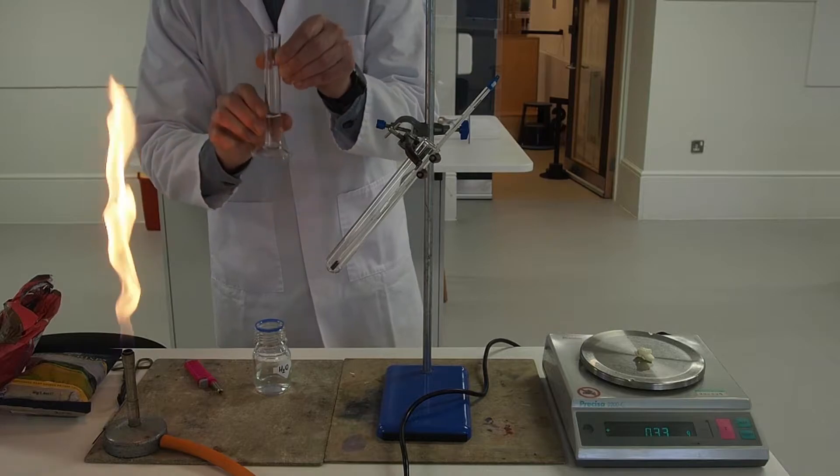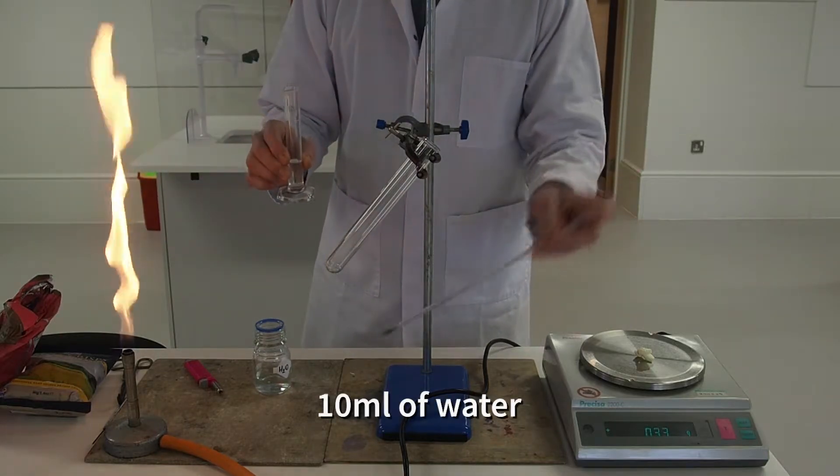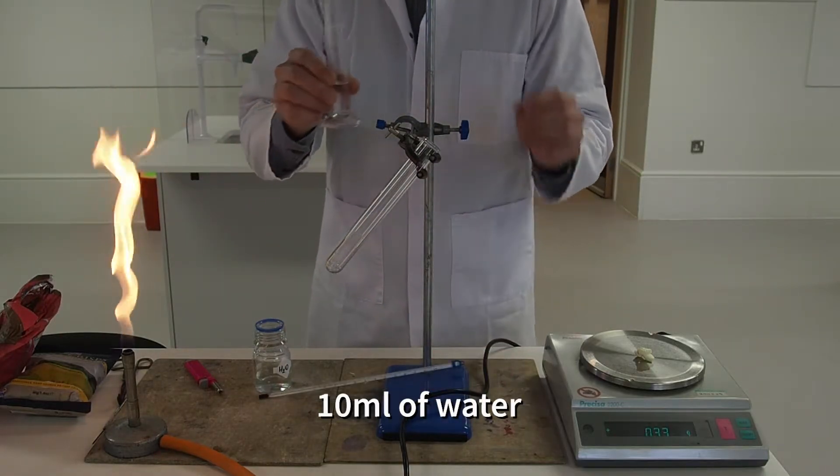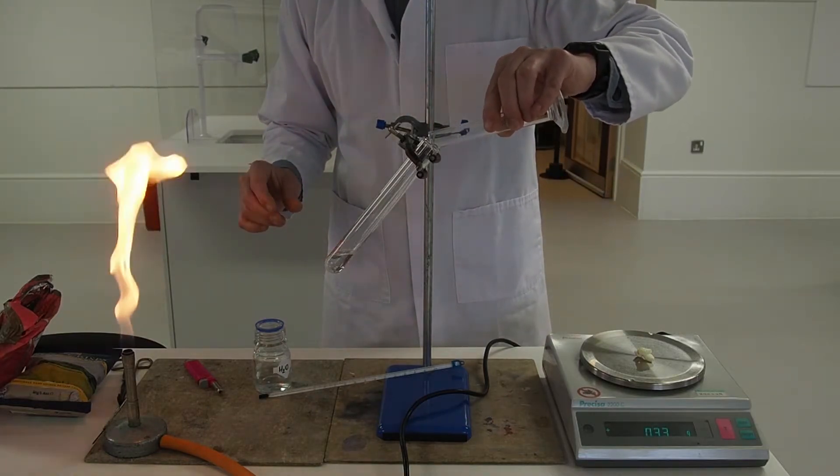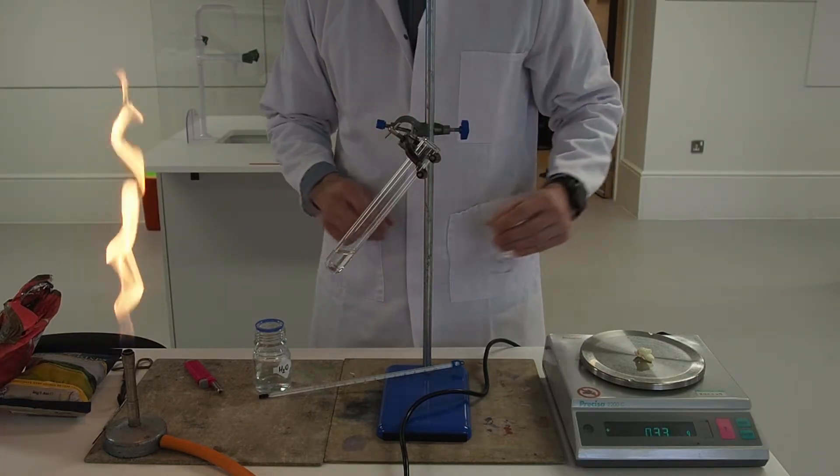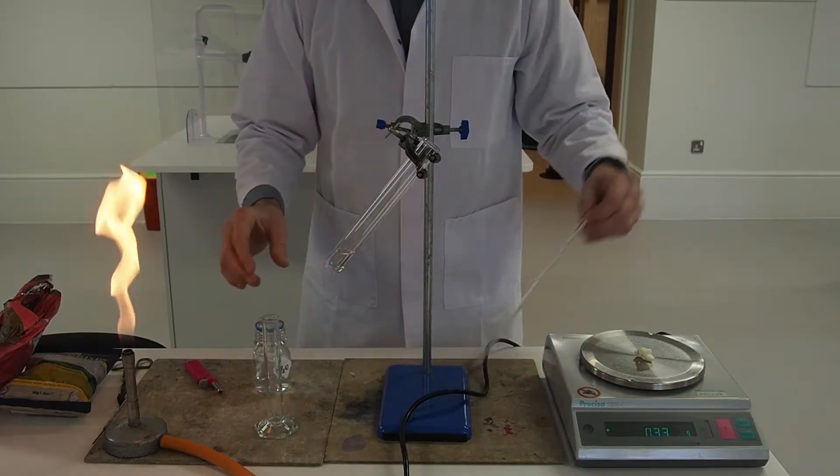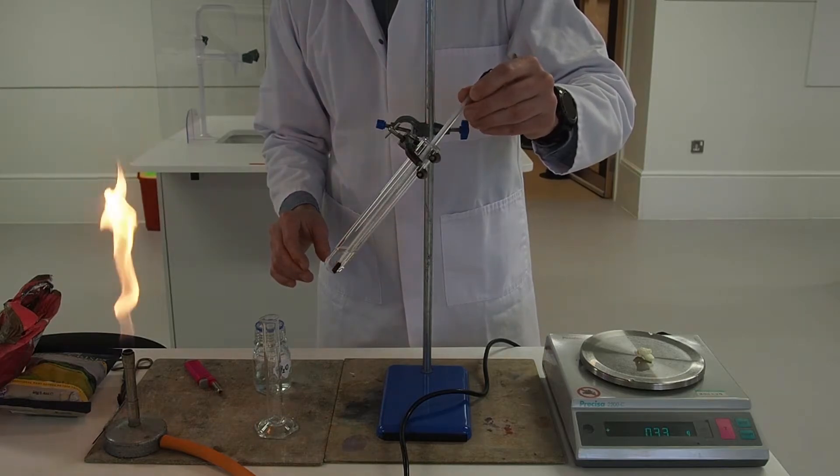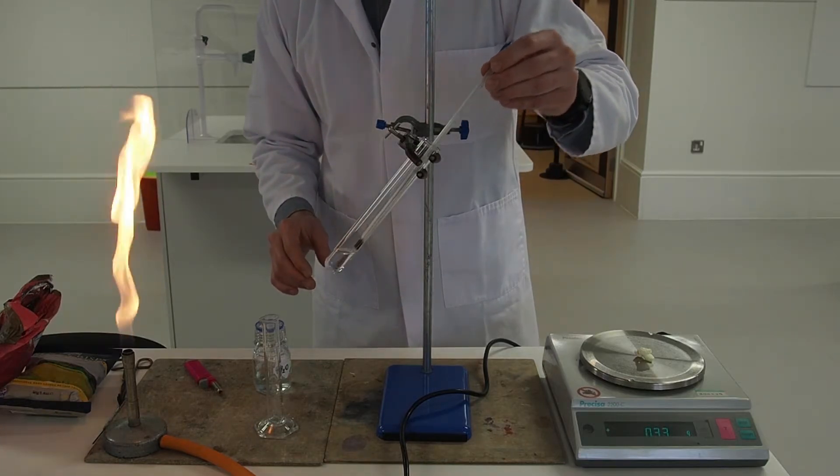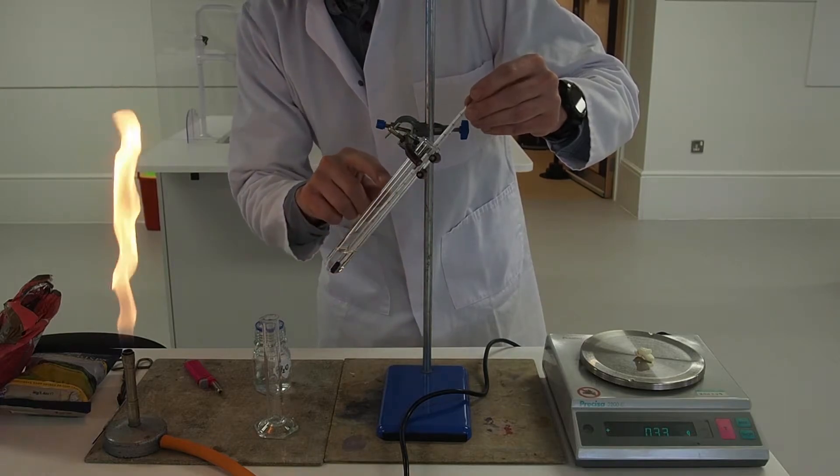First of all we need to measure out a known volume of water, in this case 10 milliliters, and add that to a boiling tube. Next we need to record the initial temperature of the water we're putting in. In this case it's 23 degrees centigrade.